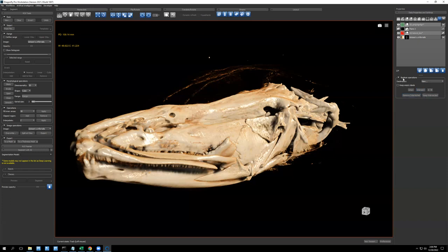These operations only appear if you select two segmentations. Otherwise, these options don't exist. They go away once you have only one selected. That's a lot of Dragonfly, you don't have options to do something until you select the right thing, and then that option appears. It's kind of annoying, but.